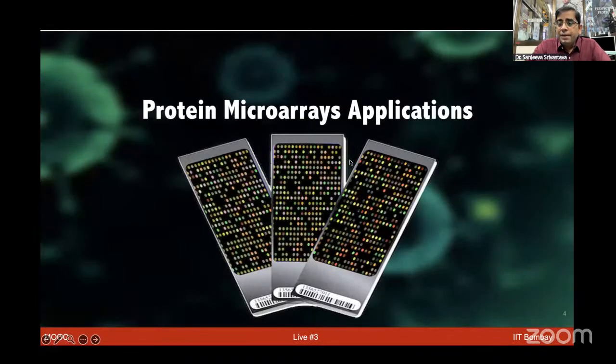These protein microarrays have many applications which have a lot of clinical implications. Often, like you've also been exposed to some of the mass spectrometry-based technologies, which also appear to be quite robust, right? But when it comes to looking at biological samples, the biofluids, blood sample, plasma sample, cerebrospinal fluid sample, other biofluids, the protein microarray actually gets an edge over mass spectrometry for analyzing, because here we are not doing any kind of pre-processing of the sample to remove the abundant protein.